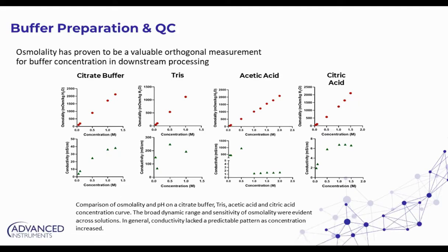As the concentration of key buffers and buffer components change, you tend to see, while maybe not perfectly linear, a more traceable, predictable pattern with osmolality over those concentrations that really take up the full span and possible range of osmolality testing.